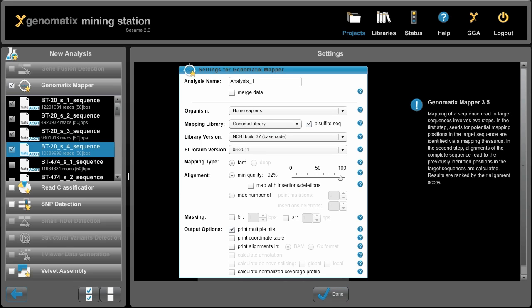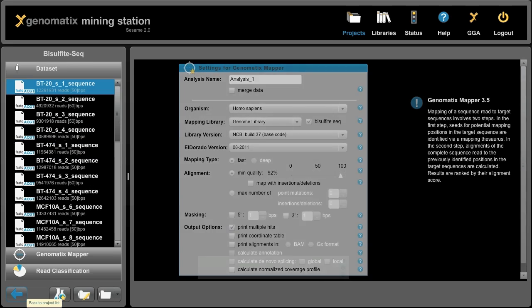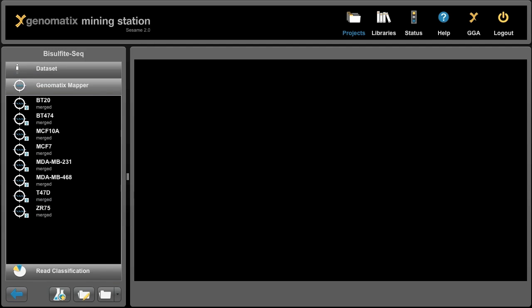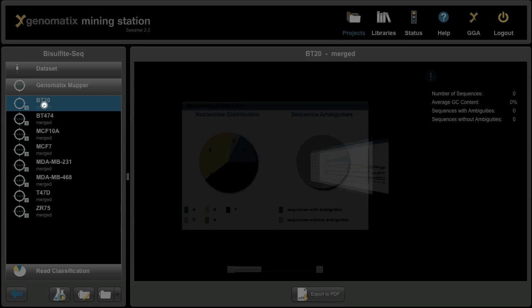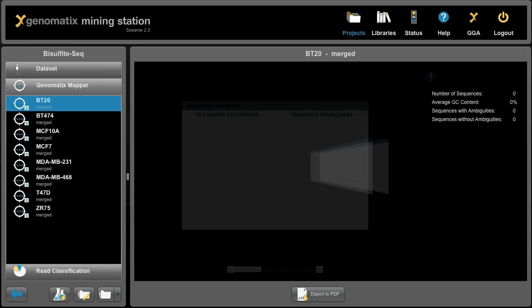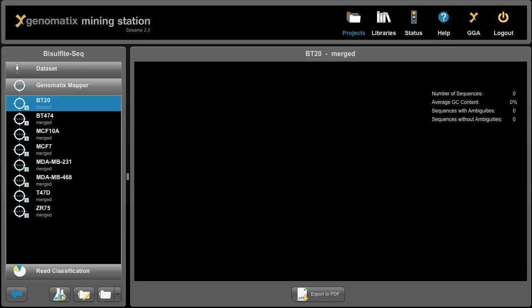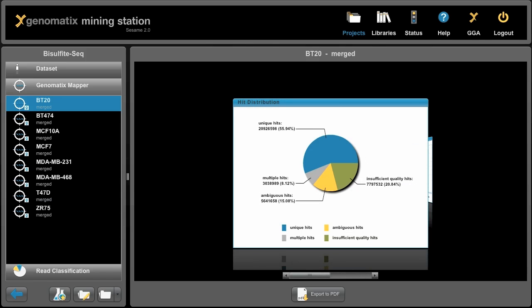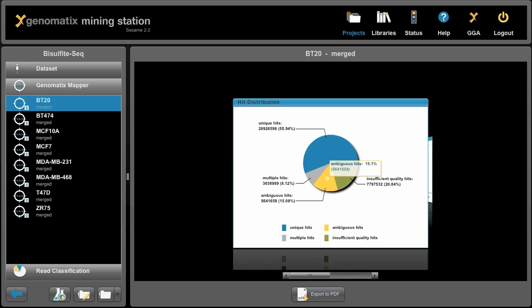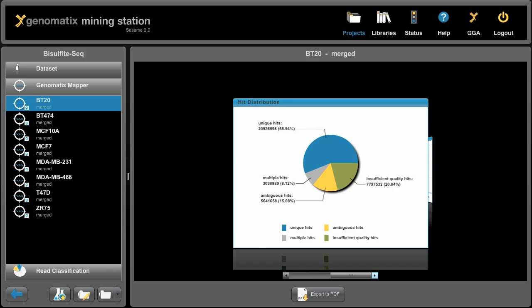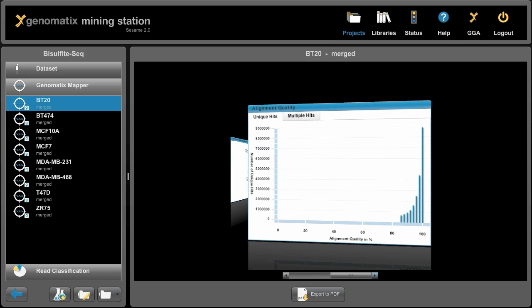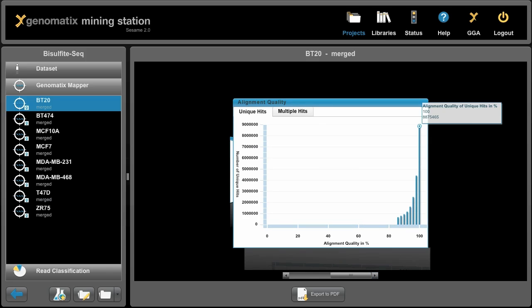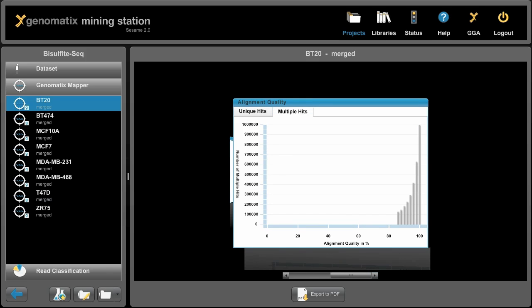For now, I want to just open the mapping results I've previously run. And we can click on BT-20 here. And that will show us some mapping statistics, how many unique hits did we get, how many multiple hits, how many ambiguous hits, and how many reads could not be mapped to the genome. Also, we get distributions of how many reads we could map without a mismatch.